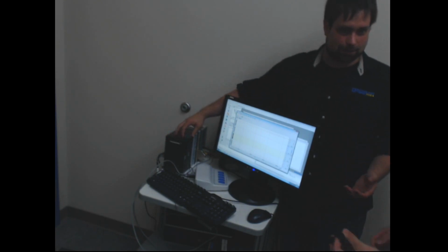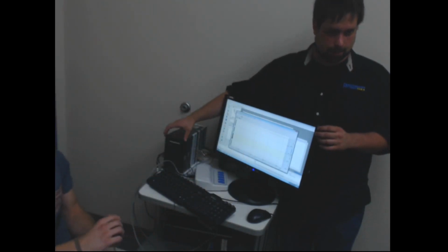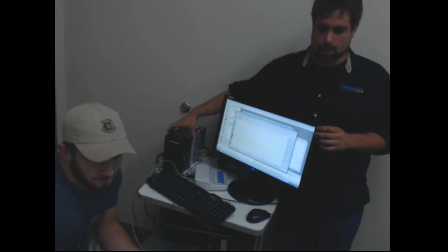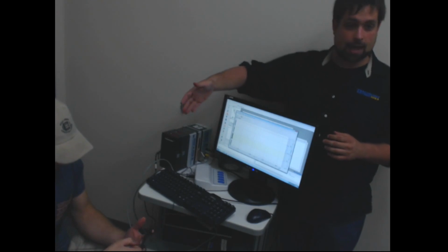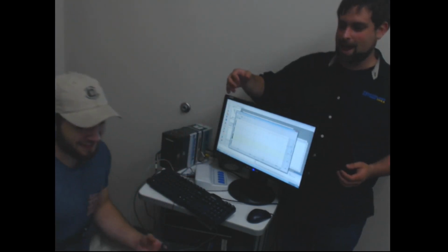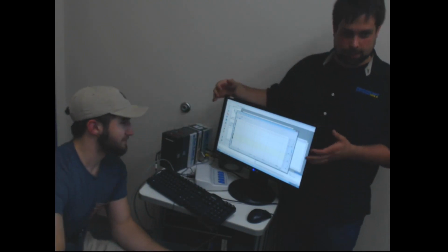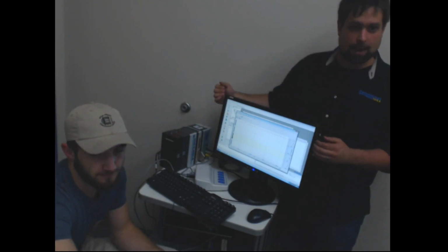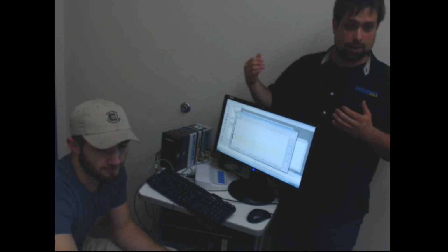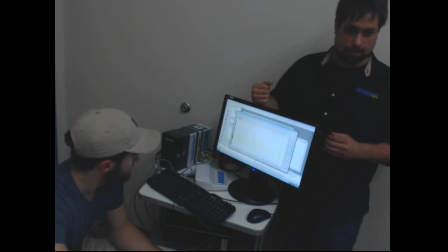We actually moved the microphone quickly, so you might be able to hear me a little better. But this first one's our respiratory belt, and the second one is our GSR module. And as you can see from Cade, he has the respiratory belt on him right now. And he has the GSR hooked up to his hands there. So I'm just going to demonstrate quickly what we're doing on the Biopac side of things to get everything set up in E-Prime, or to get all the signals from E-Prime into here.